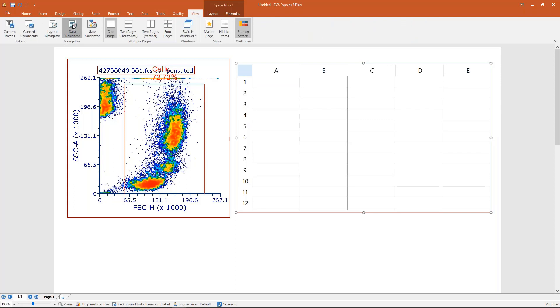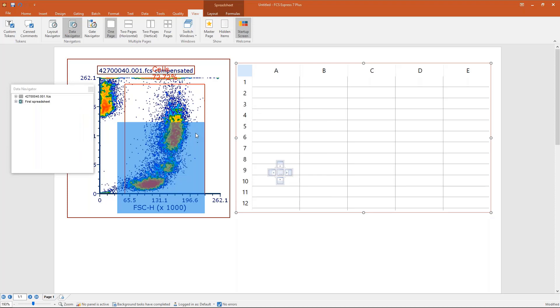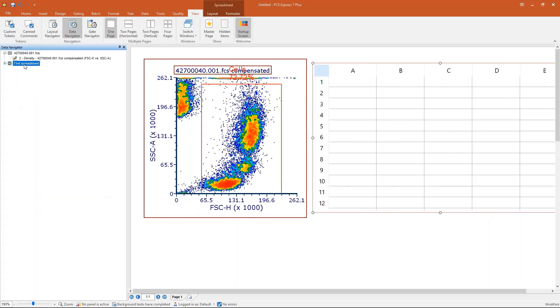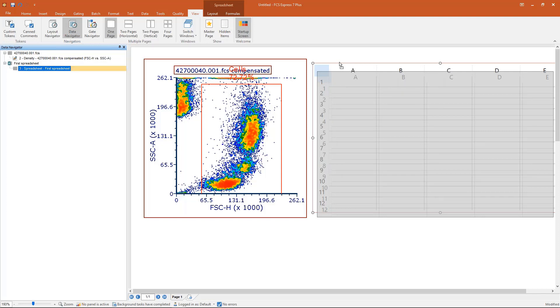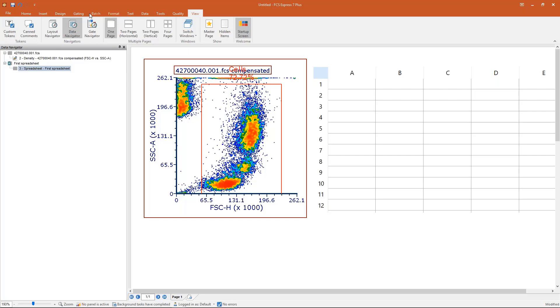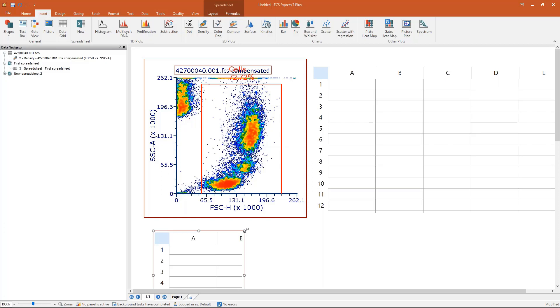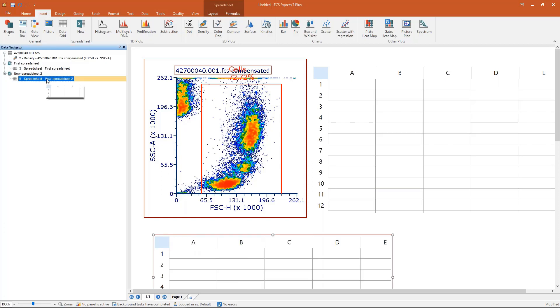The main difference with Excel is that in FCS Express, instead of multiple worksheets, you have multiple spreadsheets. You can create a new one from the Data Navigator. You can also create multiple copies of the same spreadsheet — if I duplicate this, I now have two identical copies. If I type something in one, it appears in the other copy as well, but not in a different spreadsheet, which is like a different worksheet.